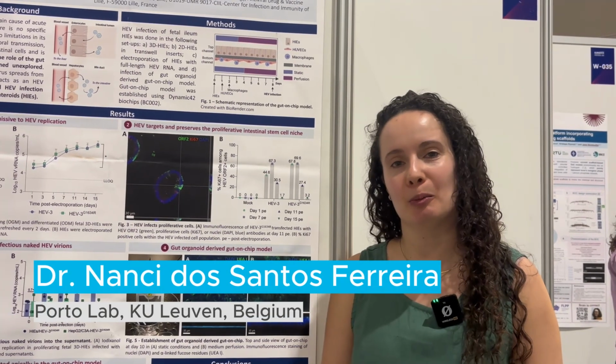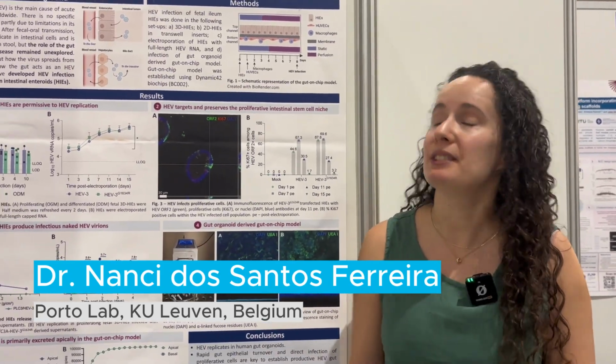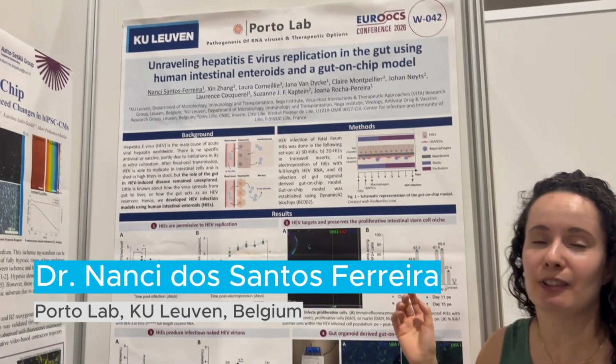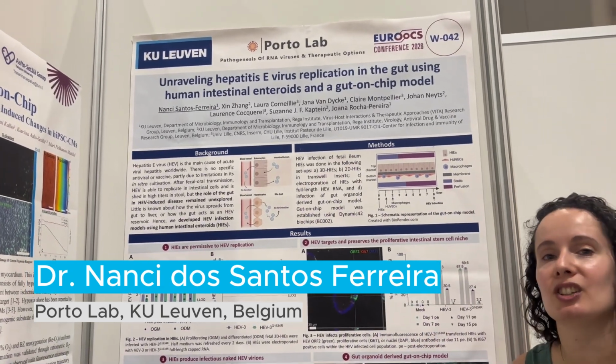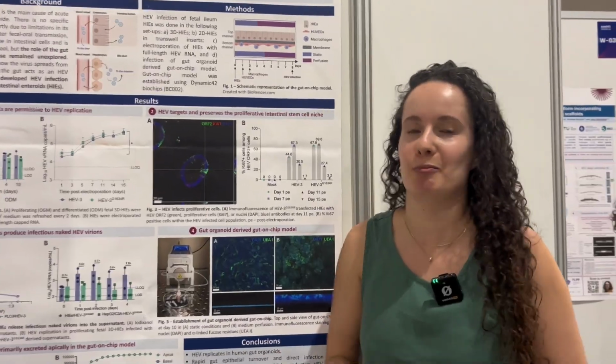Hi, I'm Nanci from Leuven in Belgium, and I'm a postdoc in the Porto Lab. My research focuses on studying hepatitis E virus replication and dissemination in the gut-liver axis. And for that, we use organoids and organ-on-chip models.